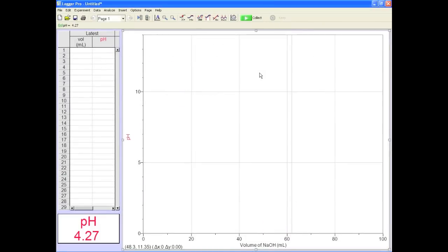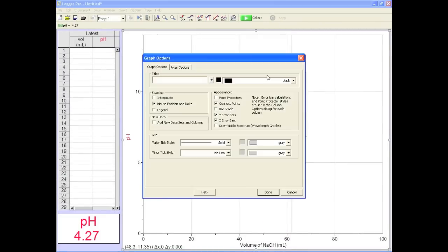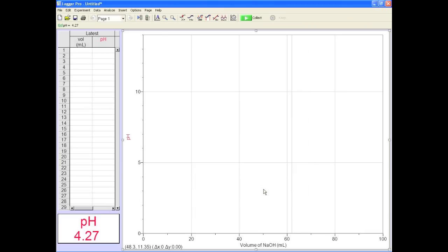Now do a preemptive mod on the graph by right clicking on the graph and selecting graph options. Check off connect points and check on point protectors. You're done here.